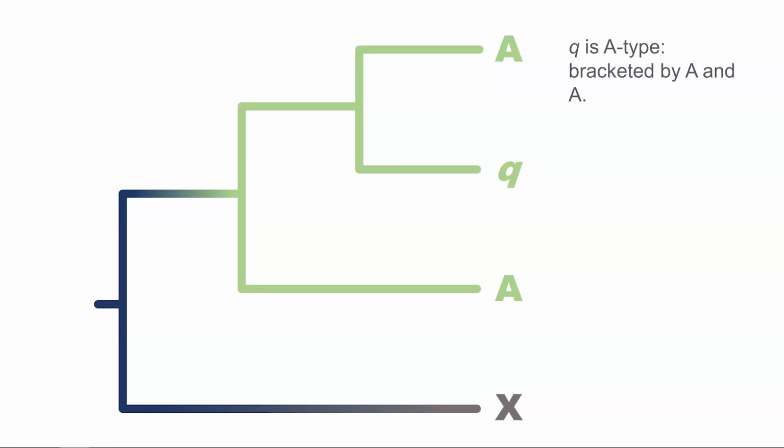Or it could also mean that an existing clade or subspecies needs to be expanded, that particular subtree is bigger than previously thought. And there's a third case. When you get a weird placement, it could also mean that your query sequence is in some way corrupt. Maybe it's too short, or maybe it's a human sequence or something like that, so it shouldn't even be there.